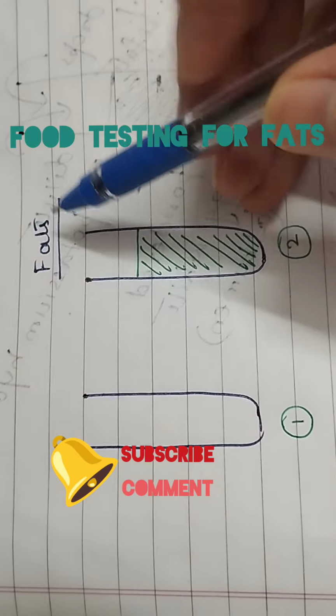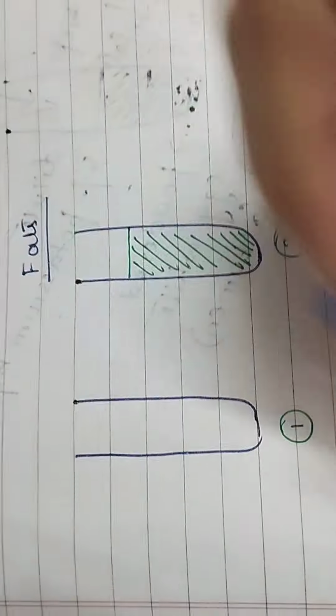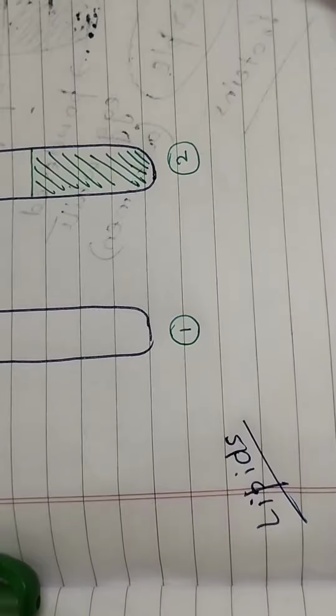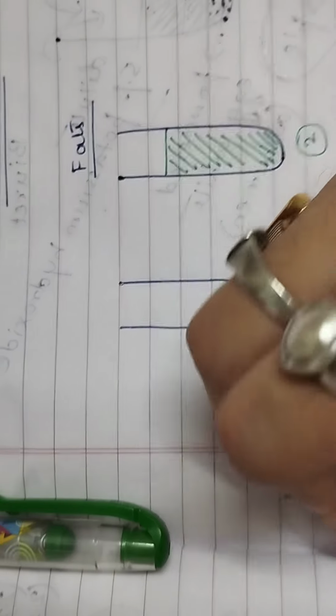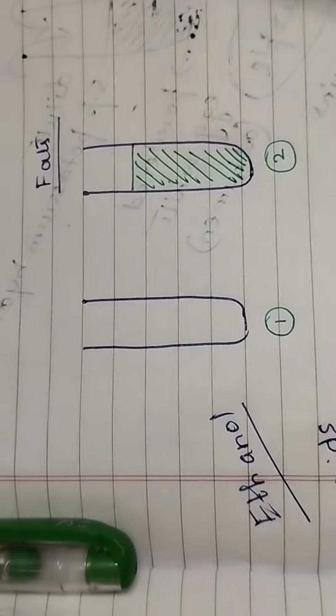Today we'll be learning about the food testing for fats. So we all know that fats are also known as lipids. Fats or lipids are both insoluble in water, but they are soluble in a certain substance which is known as ethanol, which is nothing but alcohol.